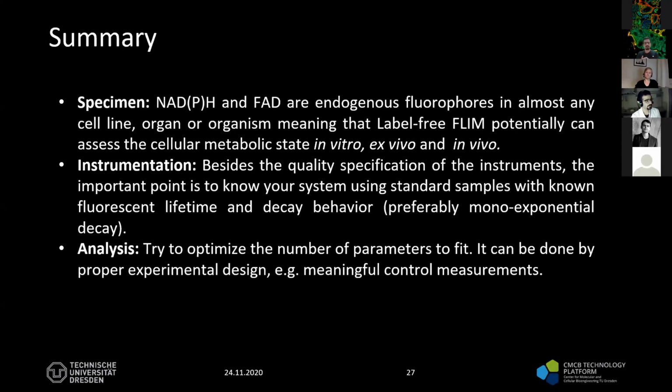To understand the behavior of your system and how the algorithms work, you can use mono-exponential decaying fluorophores to study the response, and how your system would actually behave, and what the algorithm analysis does with respect to what you need.